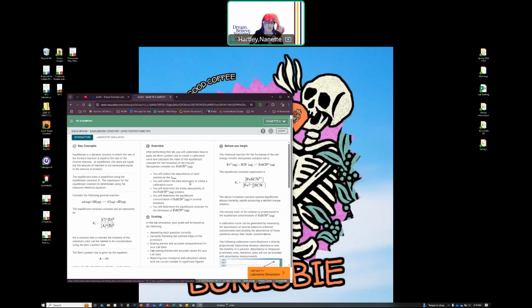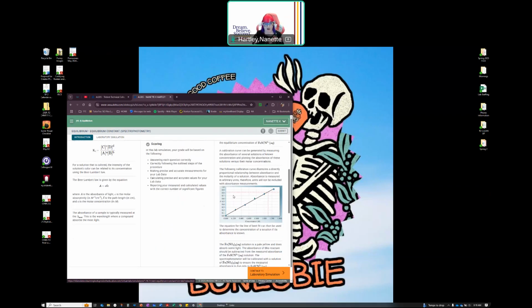Now, in addition to looking at that Beer-Lambert law, and I'm going to show you this lovely graph over here, the Beer-Lambert law generates a linear relationship, so that if we make a concentration and plot that versus the absorption, okay, concentration is down here, absorption is here. So I make a concentration versus absorption plot. It should be linear. Now it's not linear everywhere, okay? So it's only linear in certain portions.